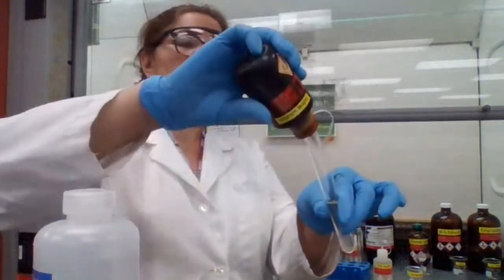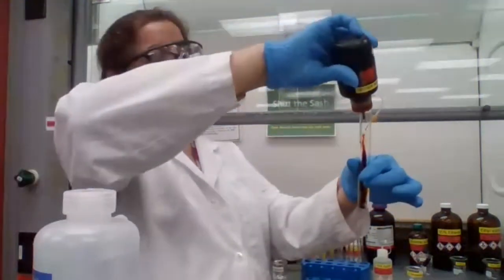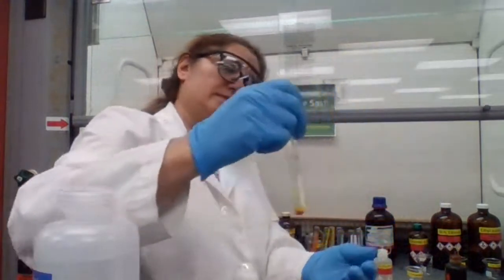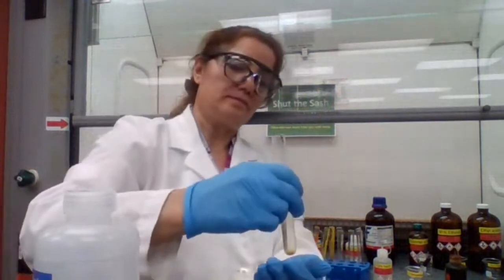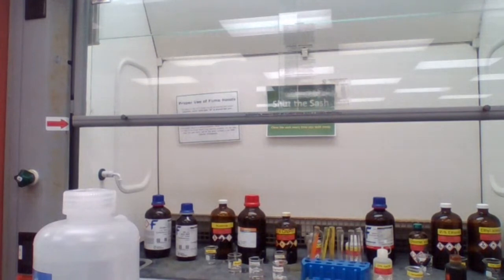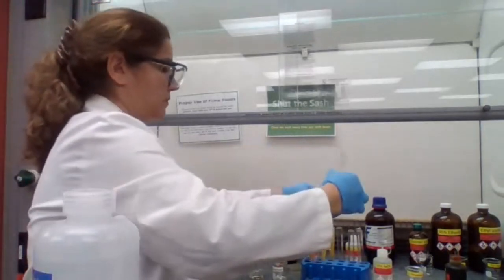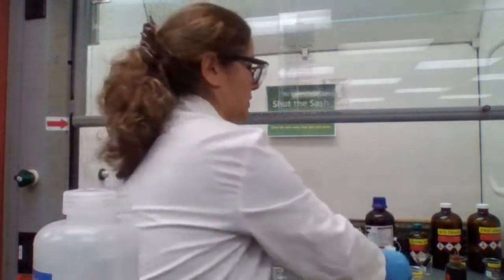When I add the iodine solution, 10 drops. Mix it well. Iodine solution.